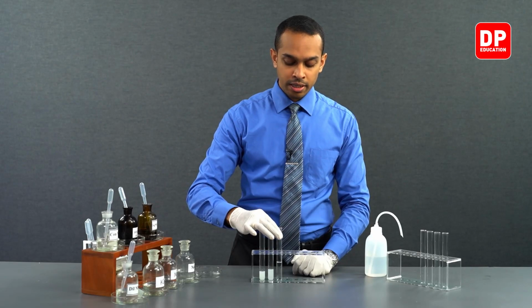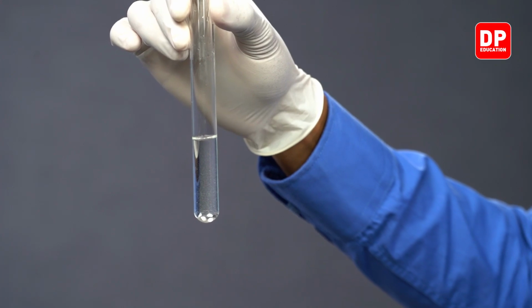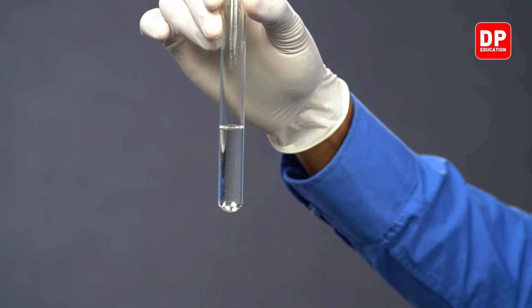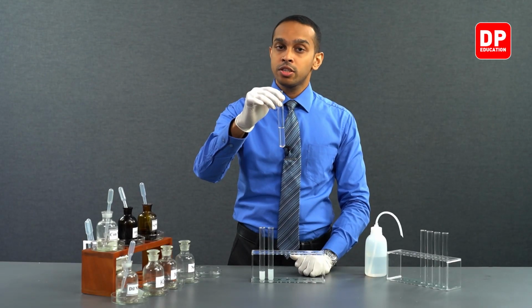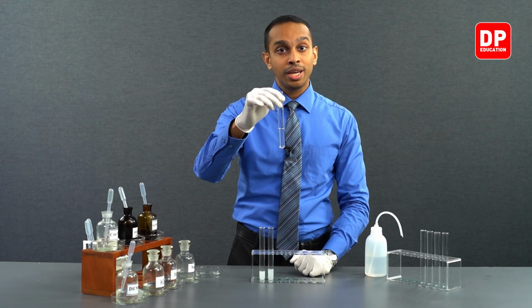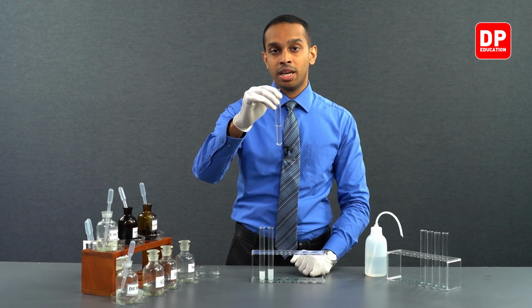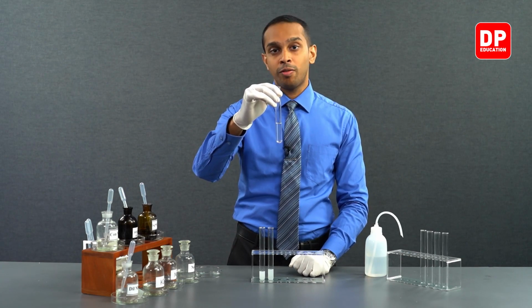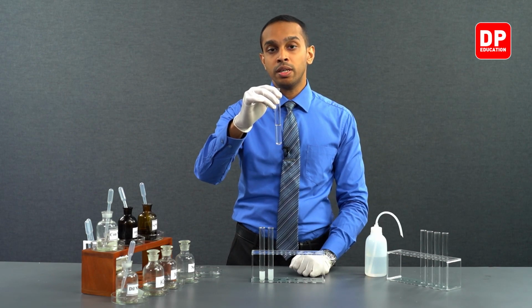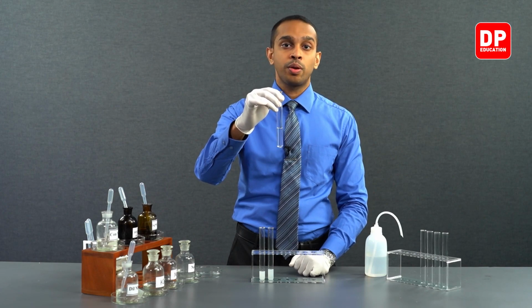And then finally, we took a little bit of the silver bromide precipitate and reacted it with concentrated ammonia. In the presence of concentrated ammonia, silver bromide will dissolve to form a clear solution. Keep in mind, dilute ammonia is not capable of dissolving silver bromide. It is concentrated ammonia that is capable of dissolving silver bromide as it forms a complex with the silver ions.